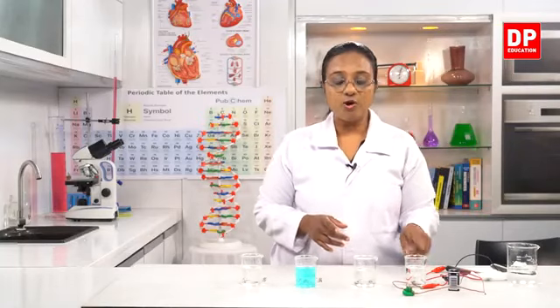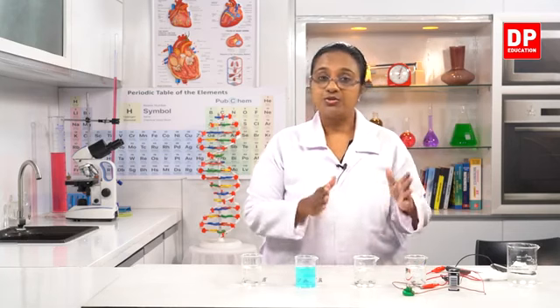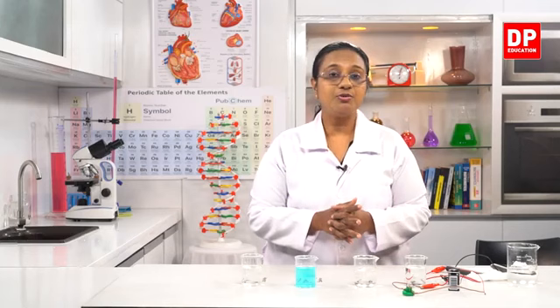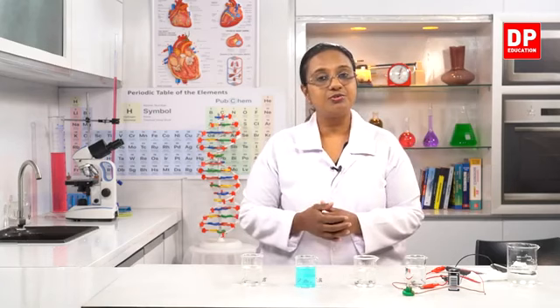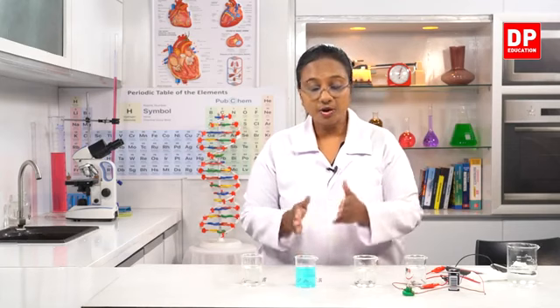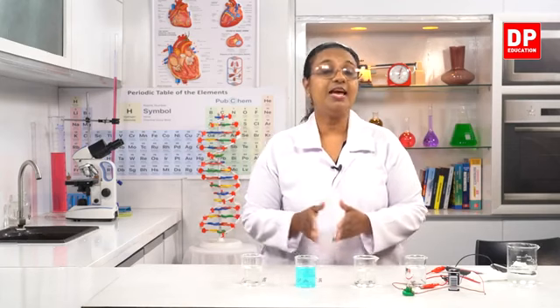So from the observations, now you saw distilled water and sugar solution, the bulb did not light. So that means they don't conduct electricity. Then what do we call those solutions? Those are non-electrolytes. Then we had copper sulfate and salt solution. With those, the bulb lit. So that means copper sulfate and salt solution conduct electricity, and therefore they are electrolytes.